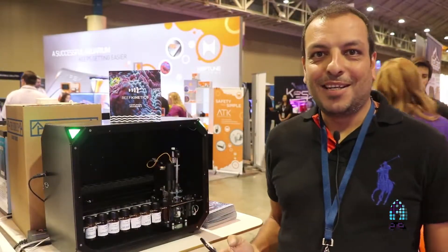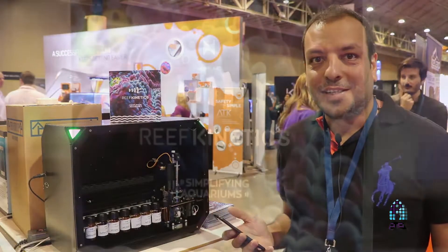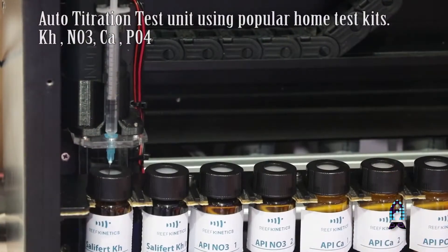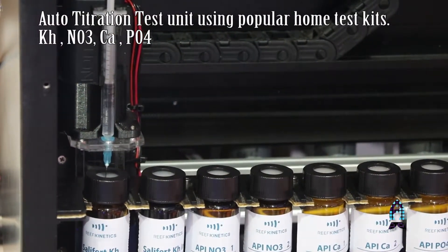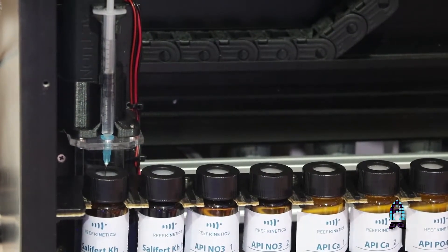Hello, my name is Rabir Khayyim from Reef Kinetics and we're at Makna 2017. I'm going to introduce to you the Reef Bot from Reef Kinetics. It's an automated reagent liquid-based testing system that will automate all the testing for you.